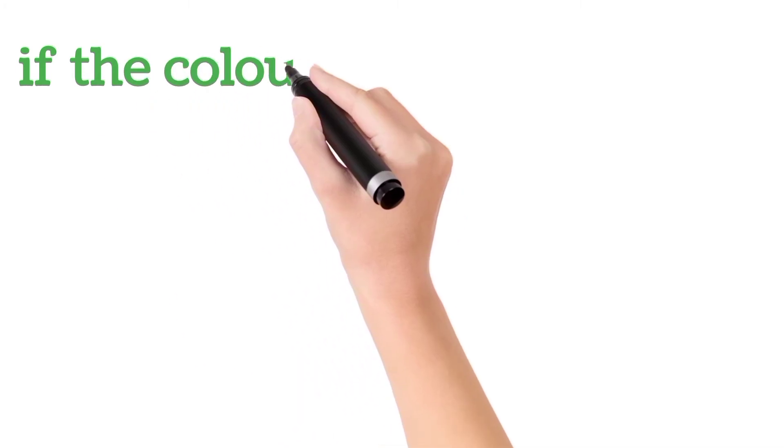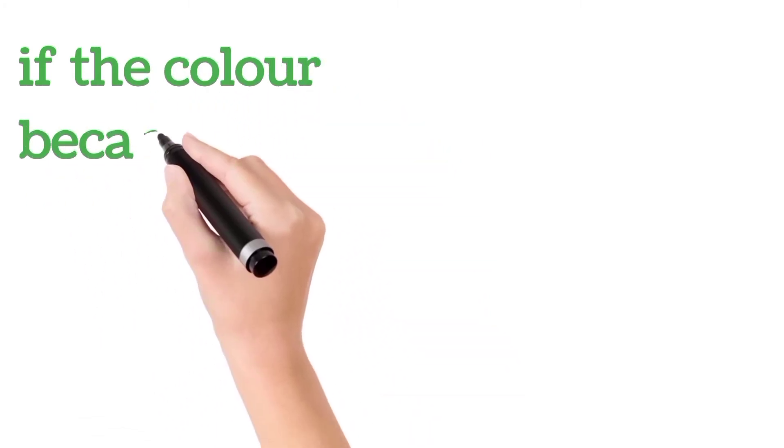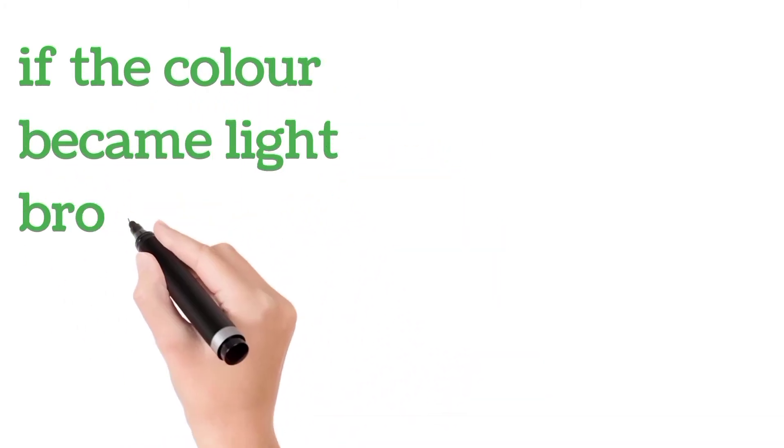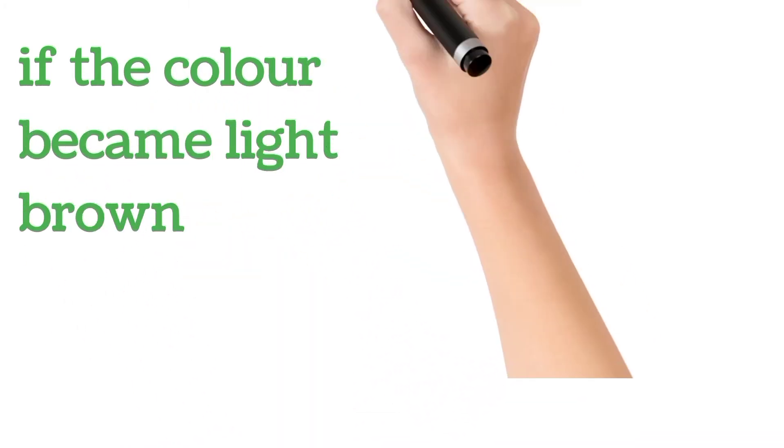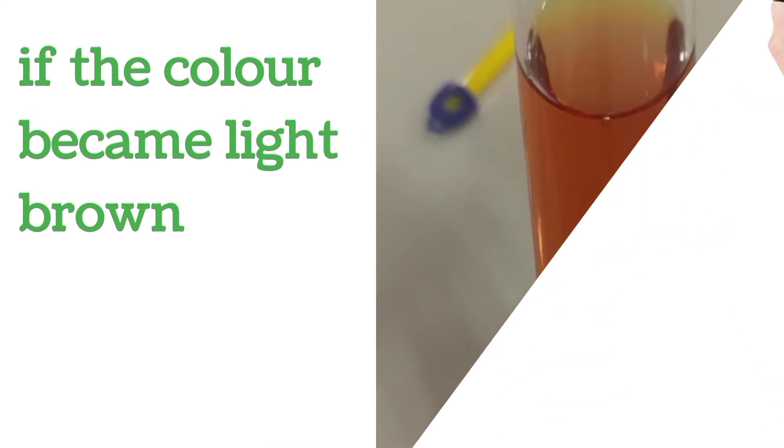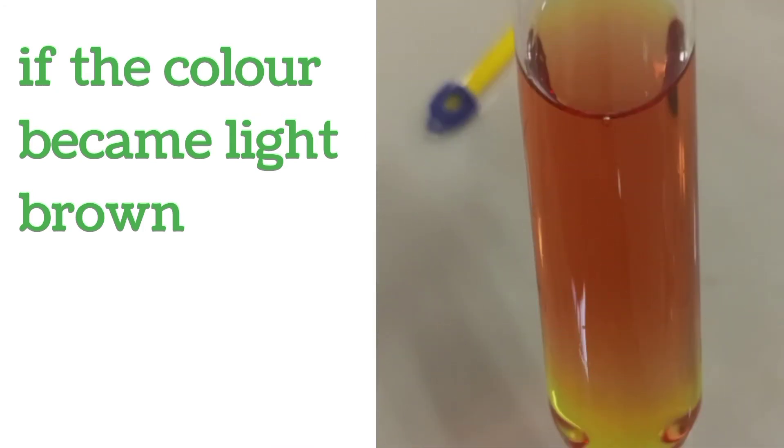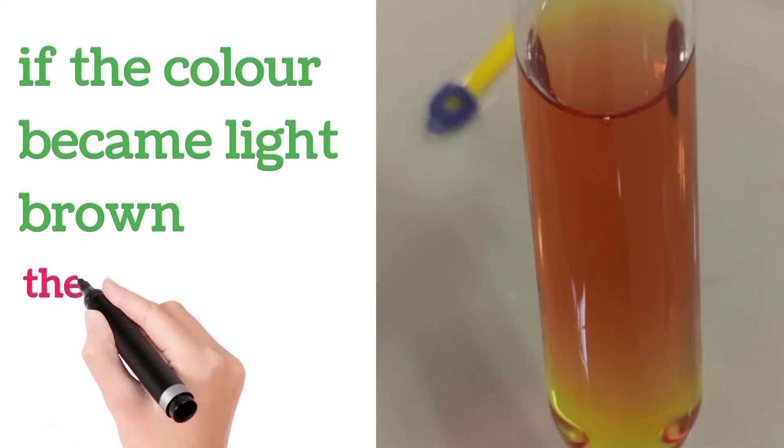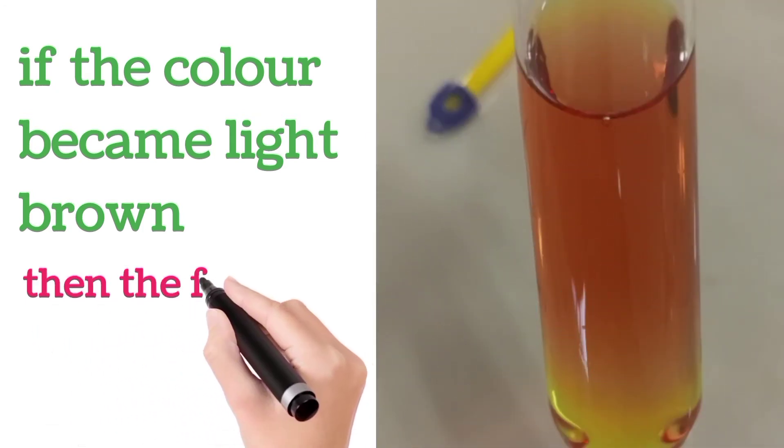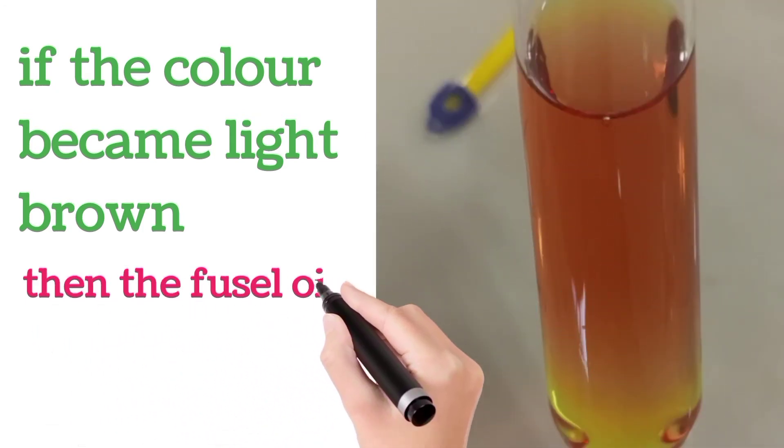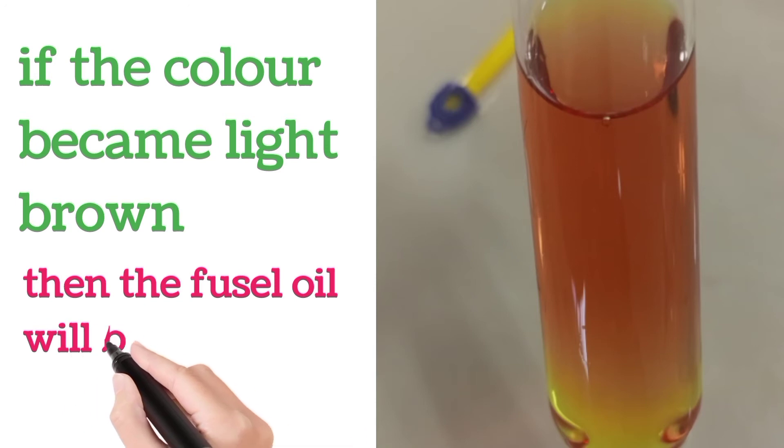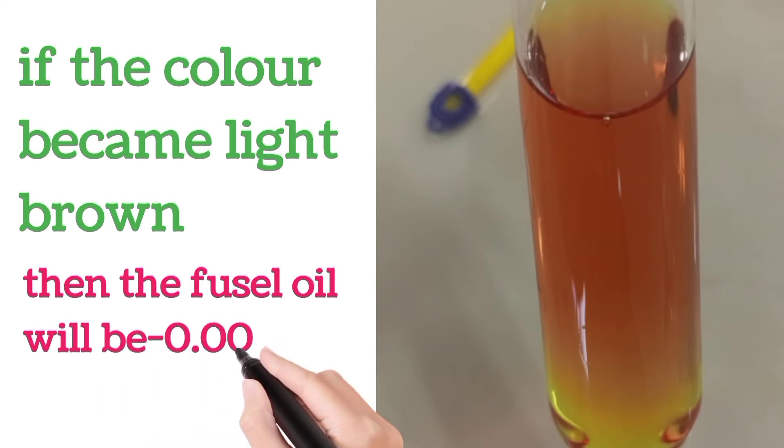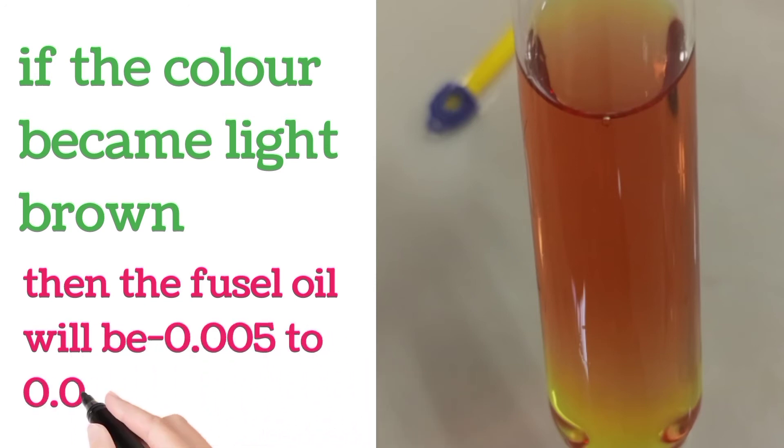If the color became light brown, then the Fusel Oil will be 0.005 to 0.01%.